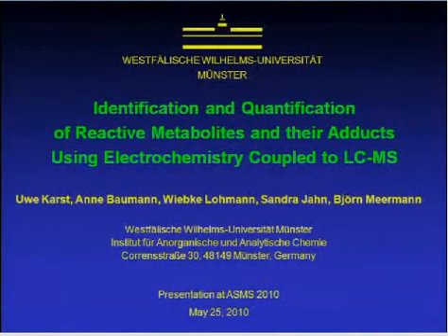Well, thank you very much, Anne, for the kind introduction. Ladies and gentlemen, I would like to separate my talk into two different parts. The first one will deal with the generation of metabolites by using electrochemistry coupled to mass spectrometry, and the second part will be directed more towards the quantification of these compounds.